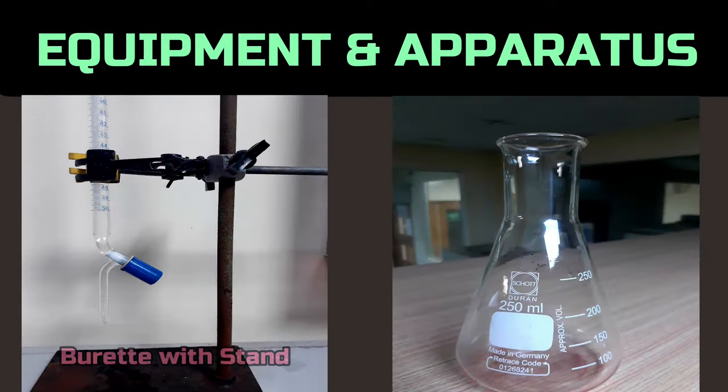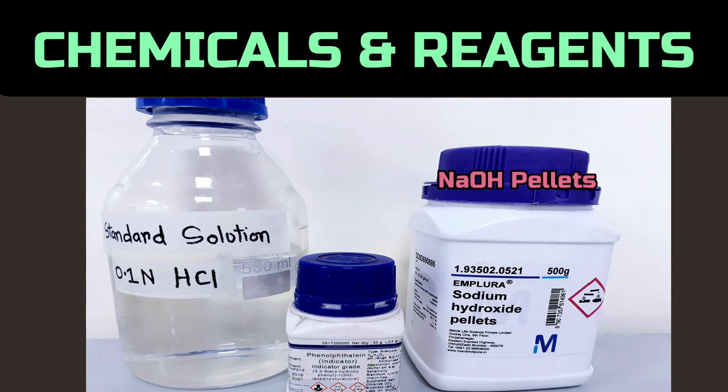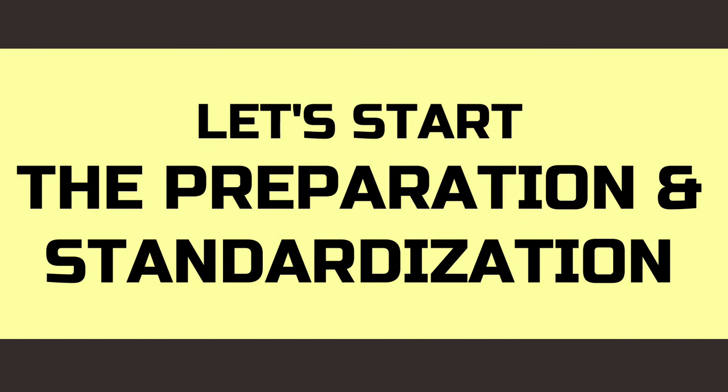Among the apparatus and chemicals, we need a burette stand, conical flask, pipette with filler, measuring cylinder, sodium hydroxide pellets, standard hydrochloric acid solution, and phenolphthalein indicator. Let's start the preparation and standardization of sodium hydroxide solution.